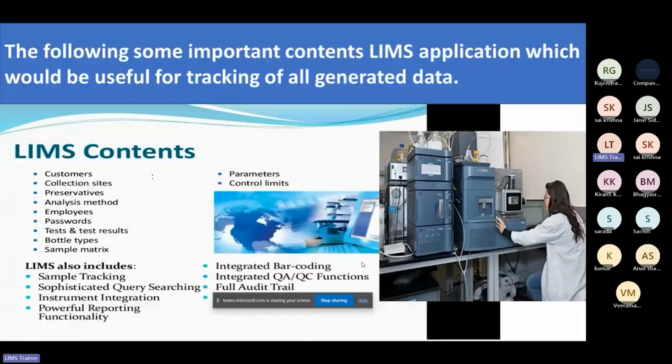So here in the LIMS contents I have explained what is included and what is connected with laboratory information management: the customers, the collection sites, the analytical methods, why the passwords are important, how the test results are handled, and the sample tracking. You understood all of this? If you have any question regarding this slide, you can ask me. Any questions?